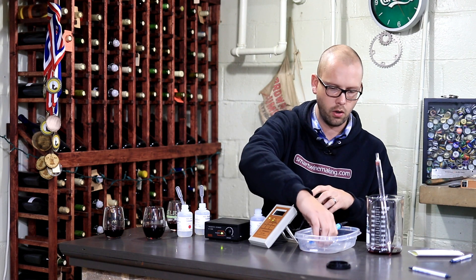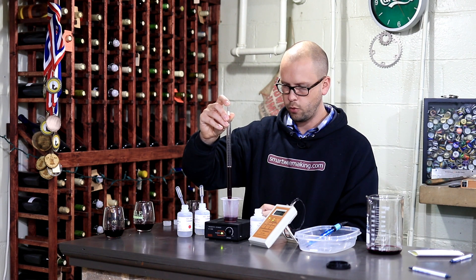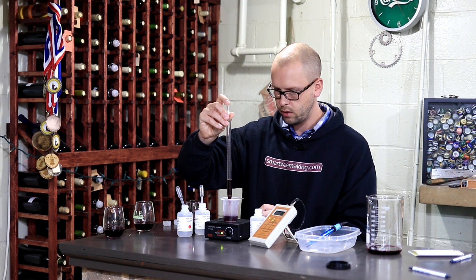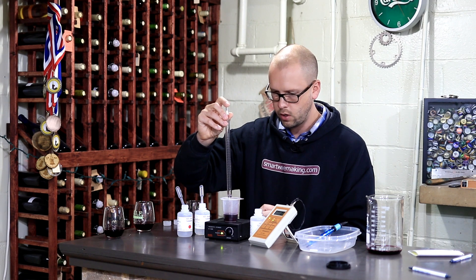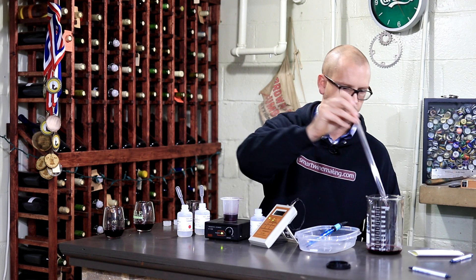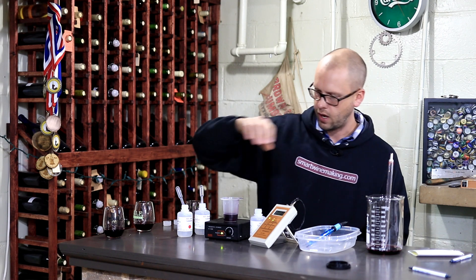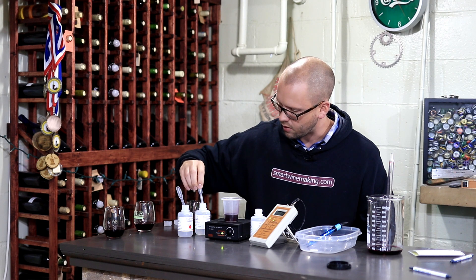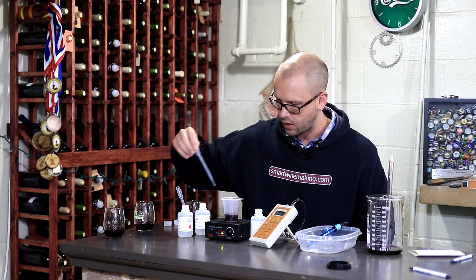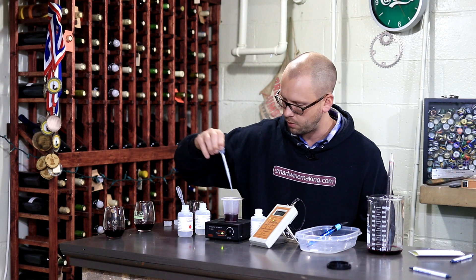The things you're going to want to be super exact with in this test are the titrant volume and the volume of wine — you really want to nail those numbers because those go into your calculation. Where I said earlier, the SO2 reactant, you just have to have enough of it, so whether you have 1.75 or 2 milliliters isn't going to be a big deal. The same goes for the acid.